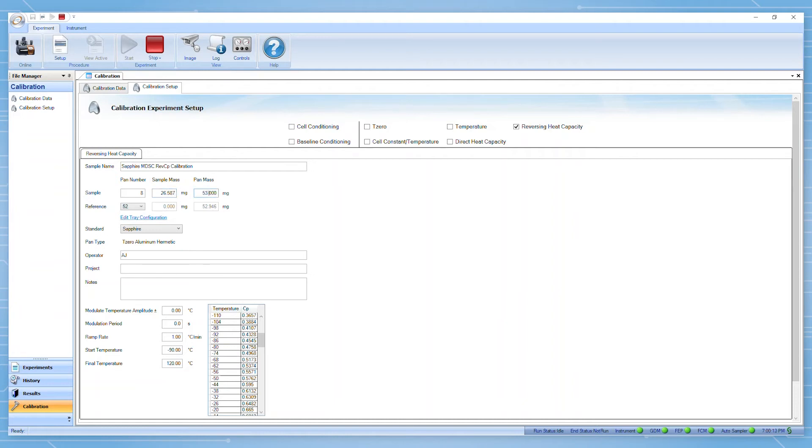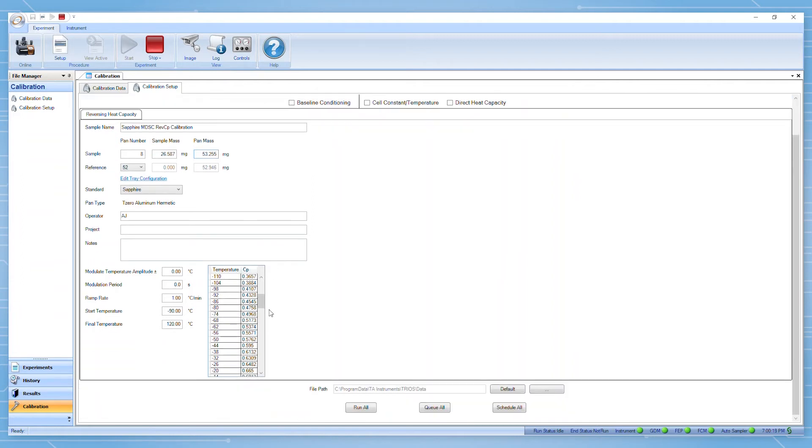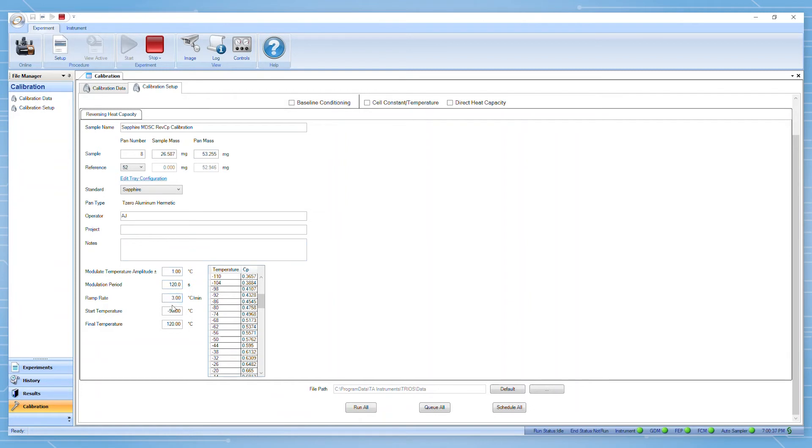Finally, you can input your experimental parameters. Typical conditions for reversing heat capacity are a modulation of plus or minus one degree Celsius over a period of 120 seconds with a ramp rate between 1 and 3 degrees Celsius per minute. The range of temperatures should be at least as broad as the desired temperature range which will be studied.